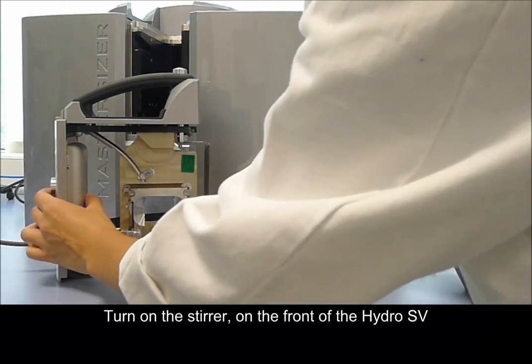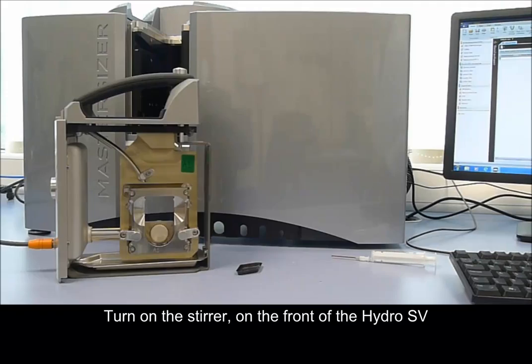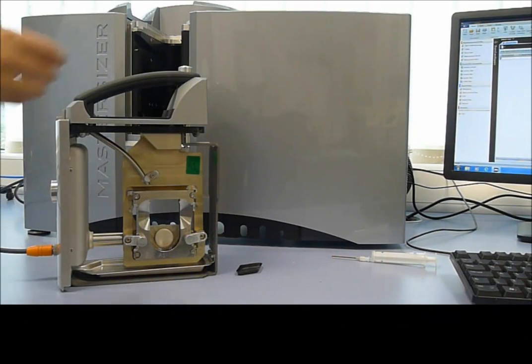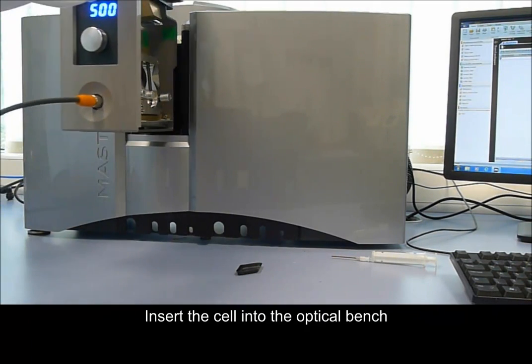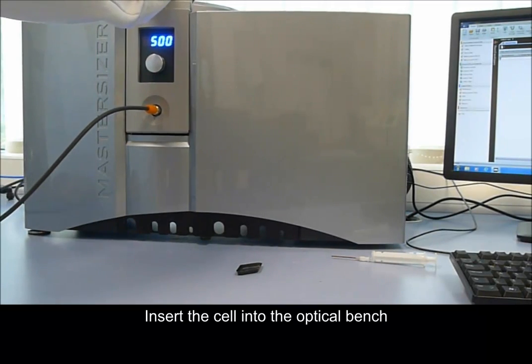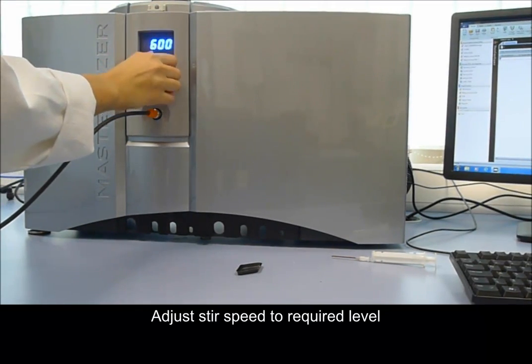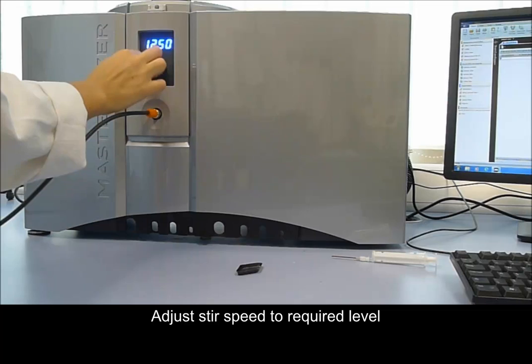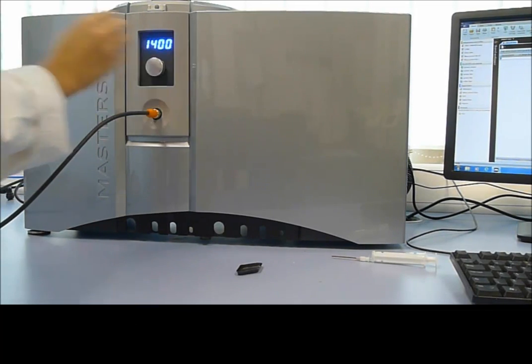Once the cuvette is in place, we can turn on the magnetic stirrer and then insert the measurement cell back into the optical bench. Then we can use the dial on the front of the cell to set an appropriate stir speed for the sample that we are going to measure.